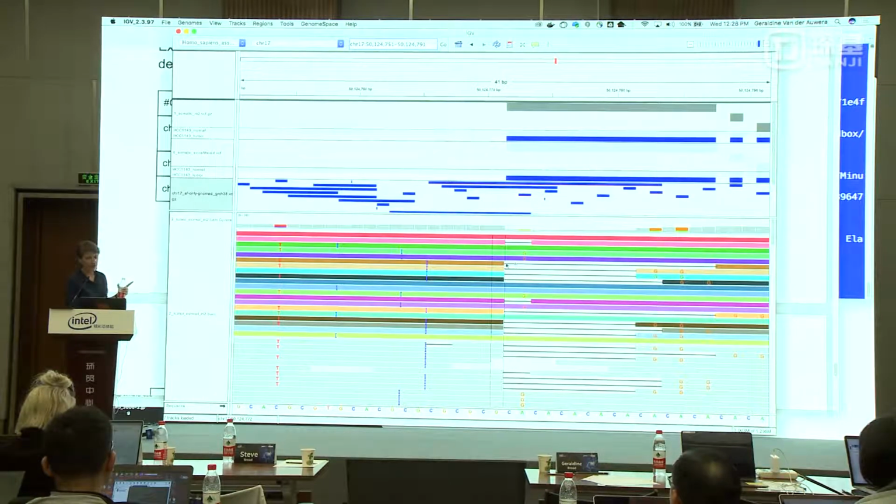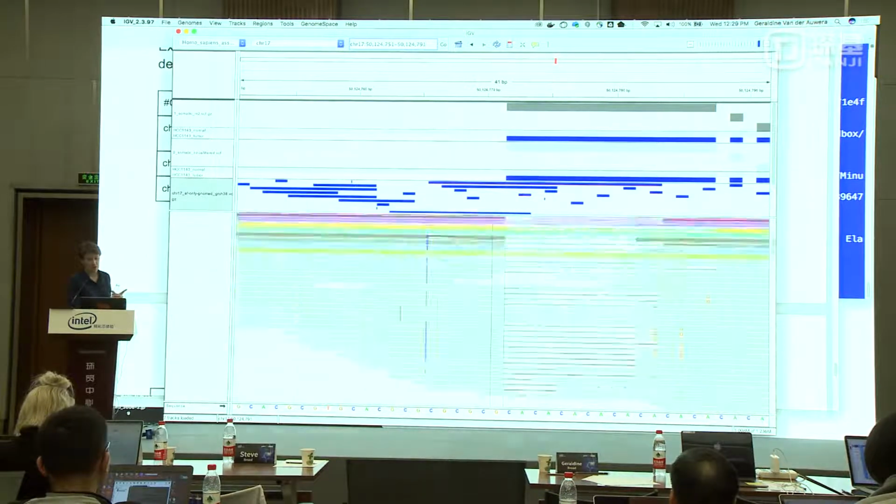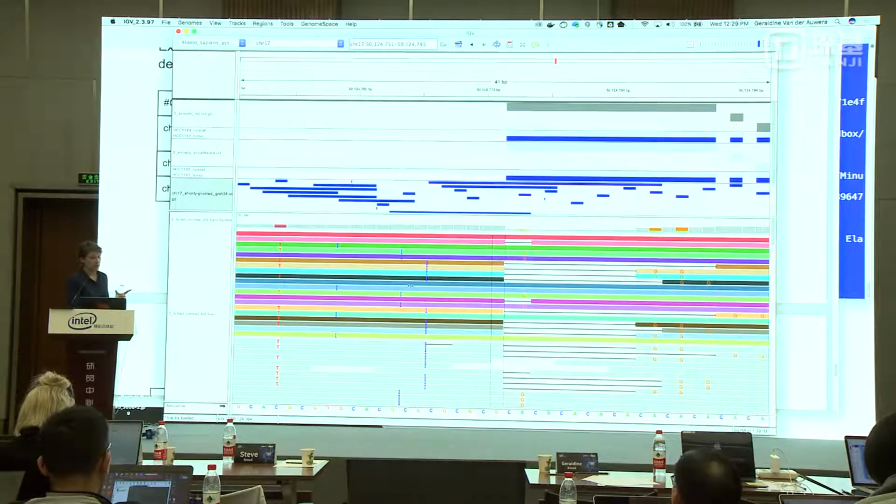That means that the assembly that Mutect2 did was a mess. Like the assembly graph had a huge number of possible paths going through it, a large number of paths compared to what you can easily expect. And so here, what we're seeing is just a lot of sequence complexity.